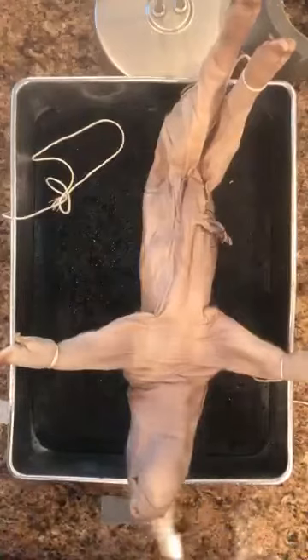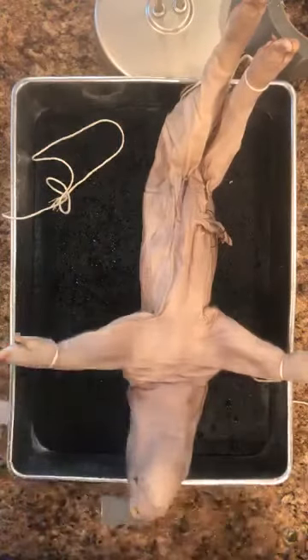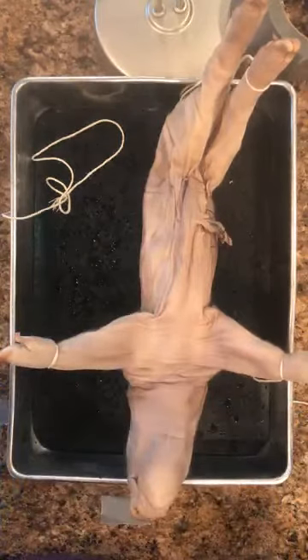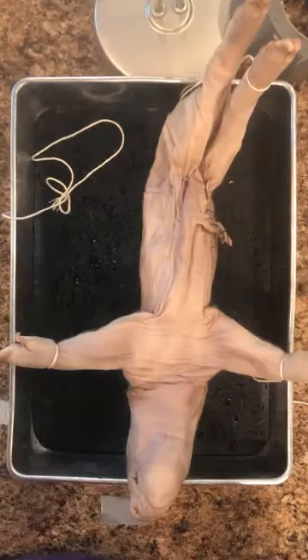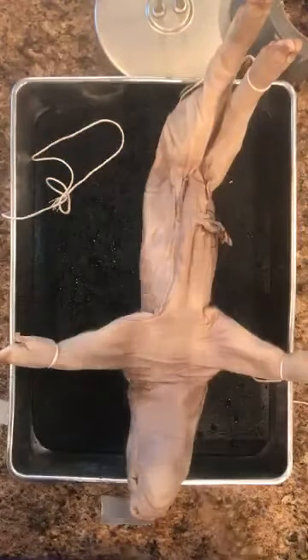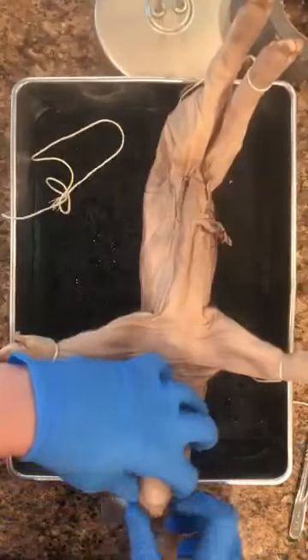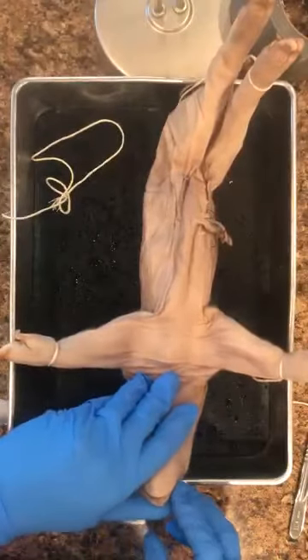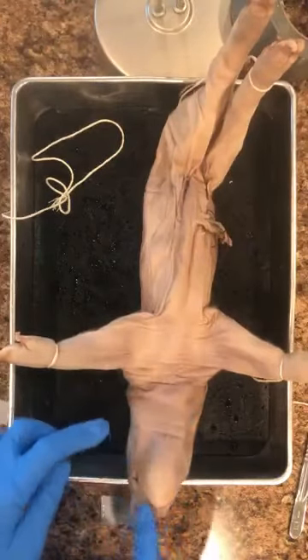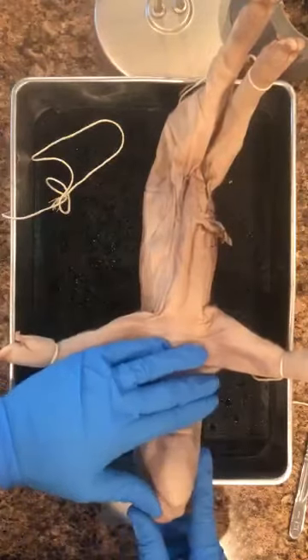All right, the mouth. Sorry it's upside down, but this is the best way I can do it with the camera still on it. The pig is tied in place. In order to see everything in the mouth, we have to make some cuts. This thing right here, it's really bumpy. This is the tongue, so the tongue is kind of sticking out of the mouth here.